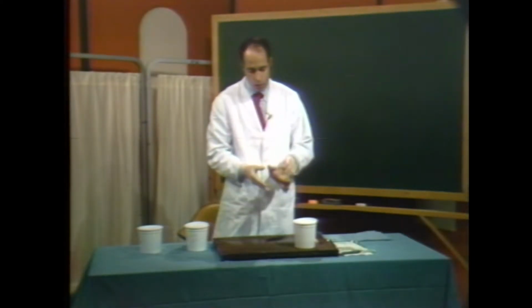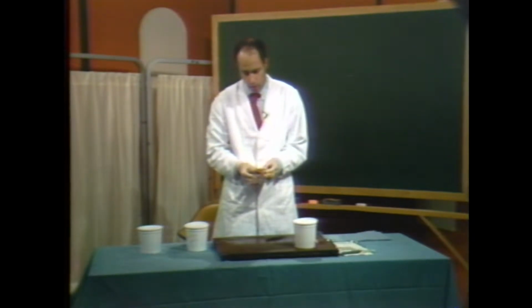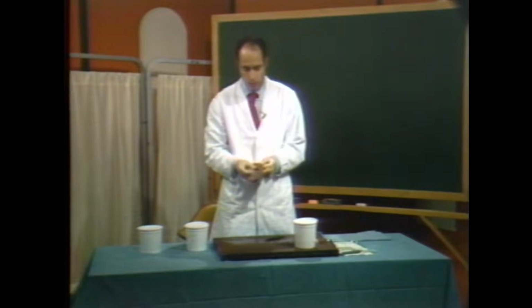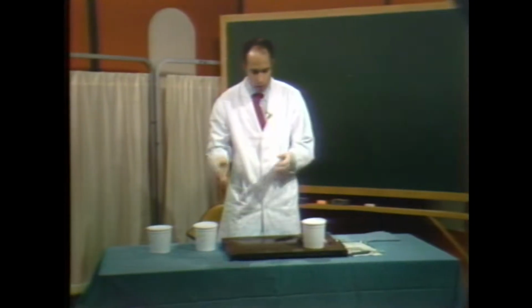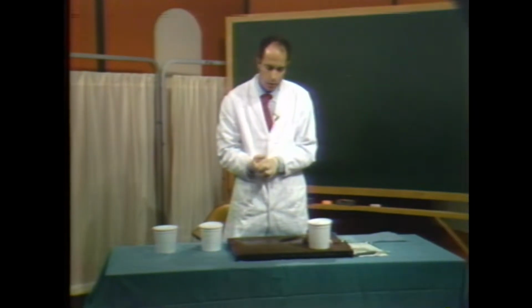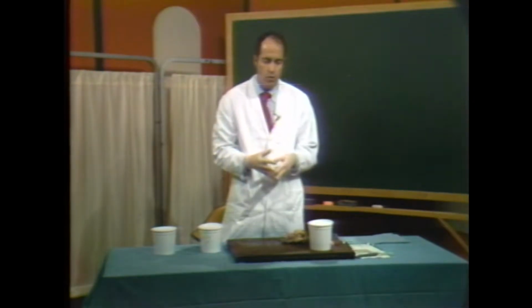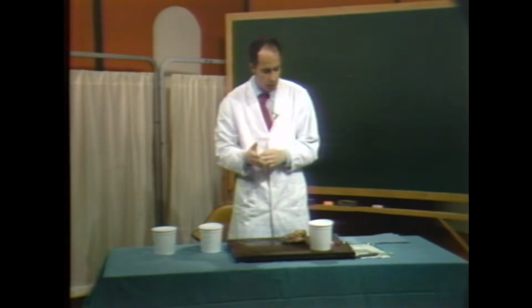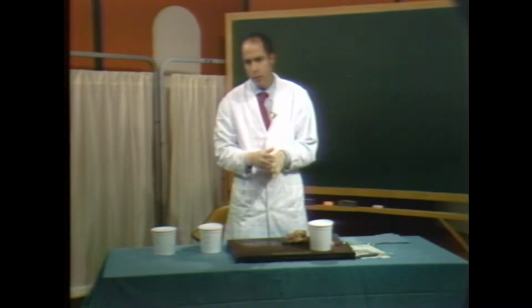This is one of the regular twice-a-month cardiac pathology conferences held here at the National Naval Medical Center. The general routine for these conferences is that we have 3 or 4 heart specimens, and as a rule I examine these specimens as unknowns, and after examining the specimen attempt to predict the patient's age and sex and a few general items regarding clinical information about the patient.